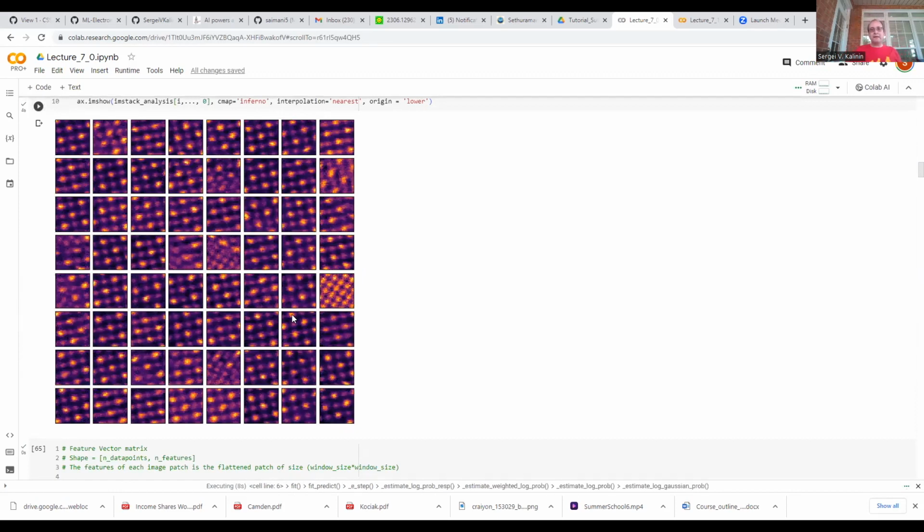So if you meditated about it, then the answer is you generally want to choose the size of your subimage to be such that it is in some sense commensurate with the lattice parameter of your system. You can choose it to be one lattice parameter, two lattice parameters, or 1.4, which corresponds to the nearest neighbor atoms in the 1,1 direction, so square root 2. So you basically do it based on the expected physics of the system.